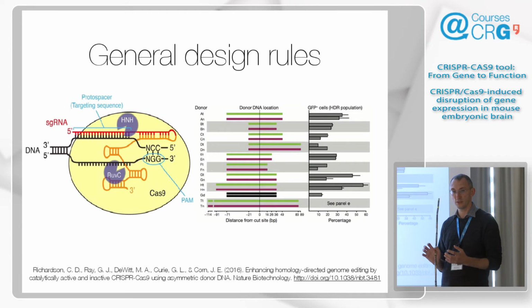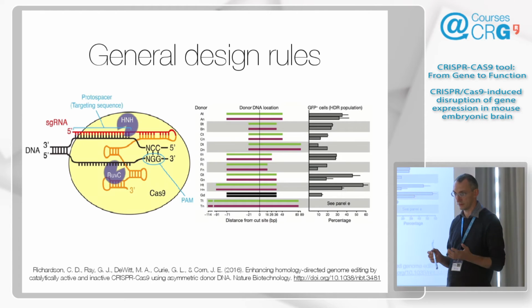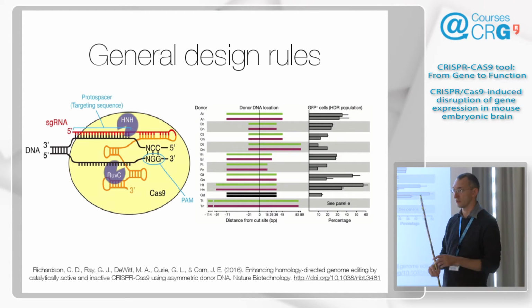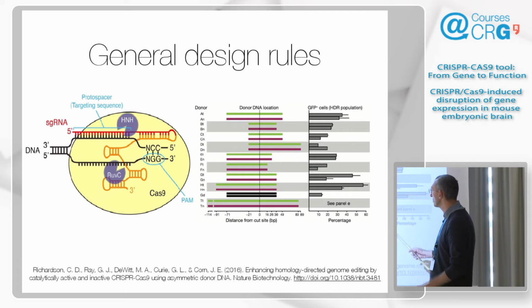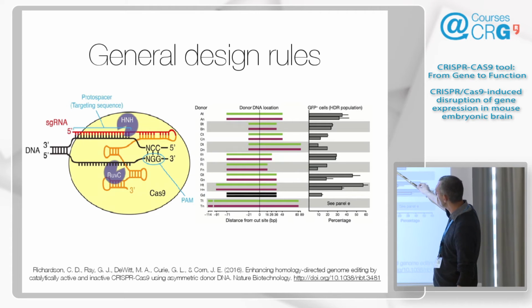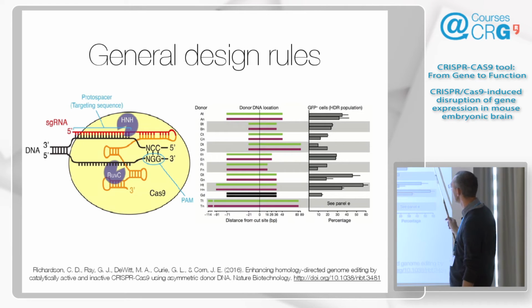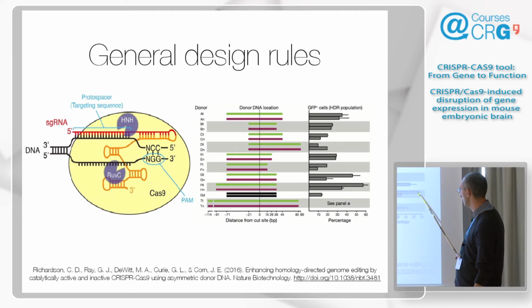That basically means that Cas9 is inhibiting normal repair through the usual end processing and invasion and so on. But oligo repair will proceed because it has a template that's sticking out. So what they do is they tried the top and the bottom strand, and they tried different lengths of left and right. And you see this varies quite a bit. But there's one optimal case, and let me think now.